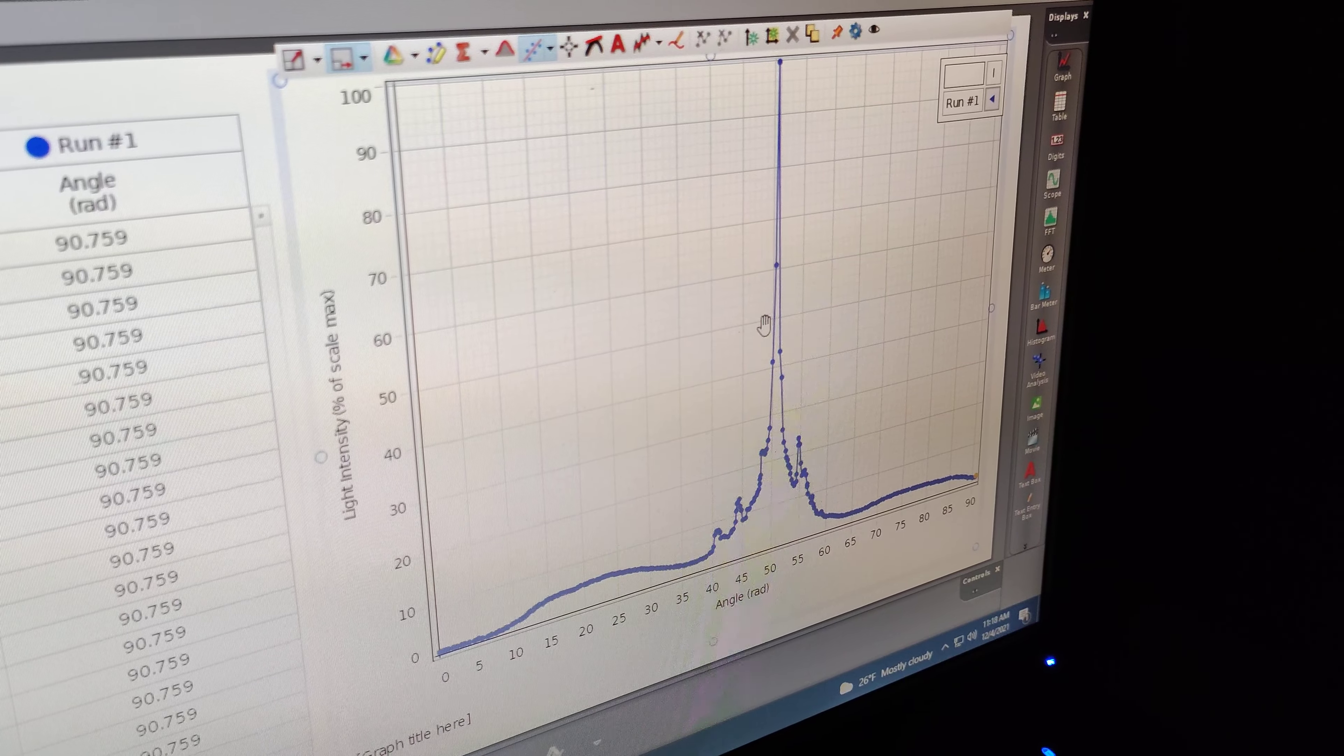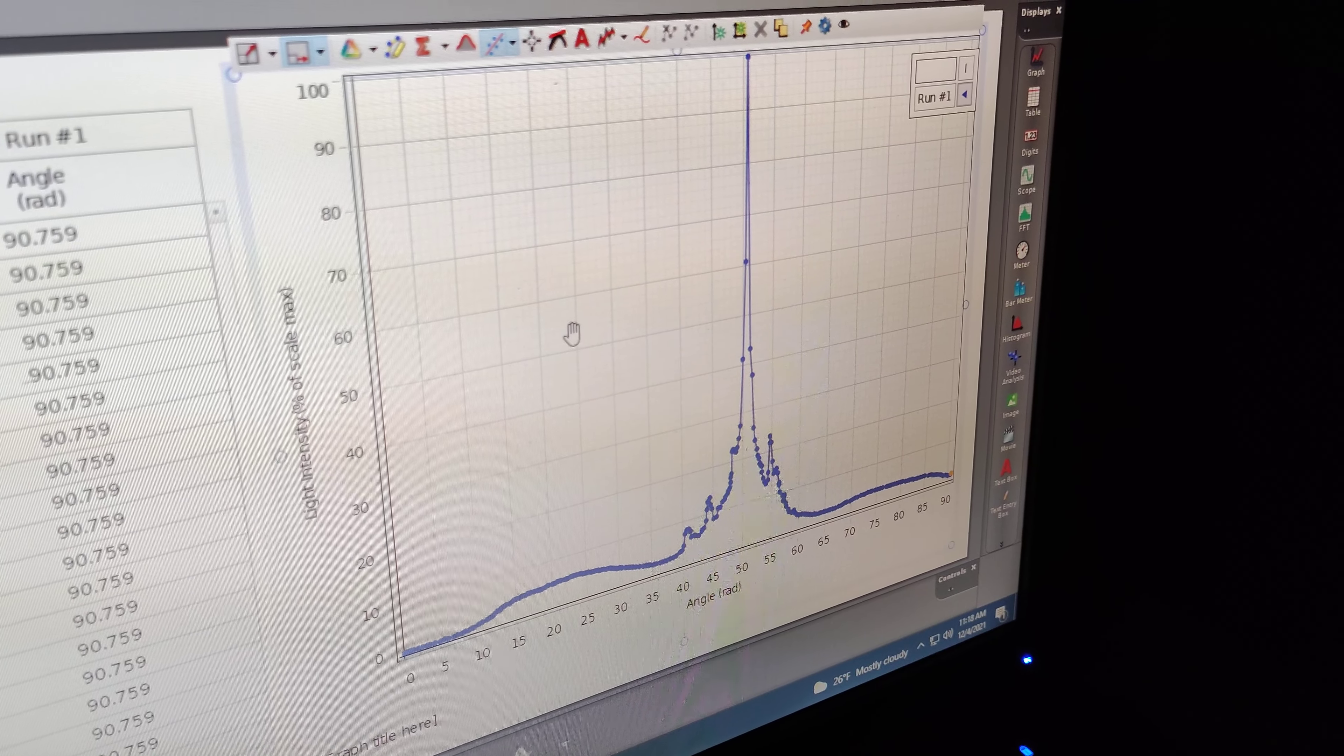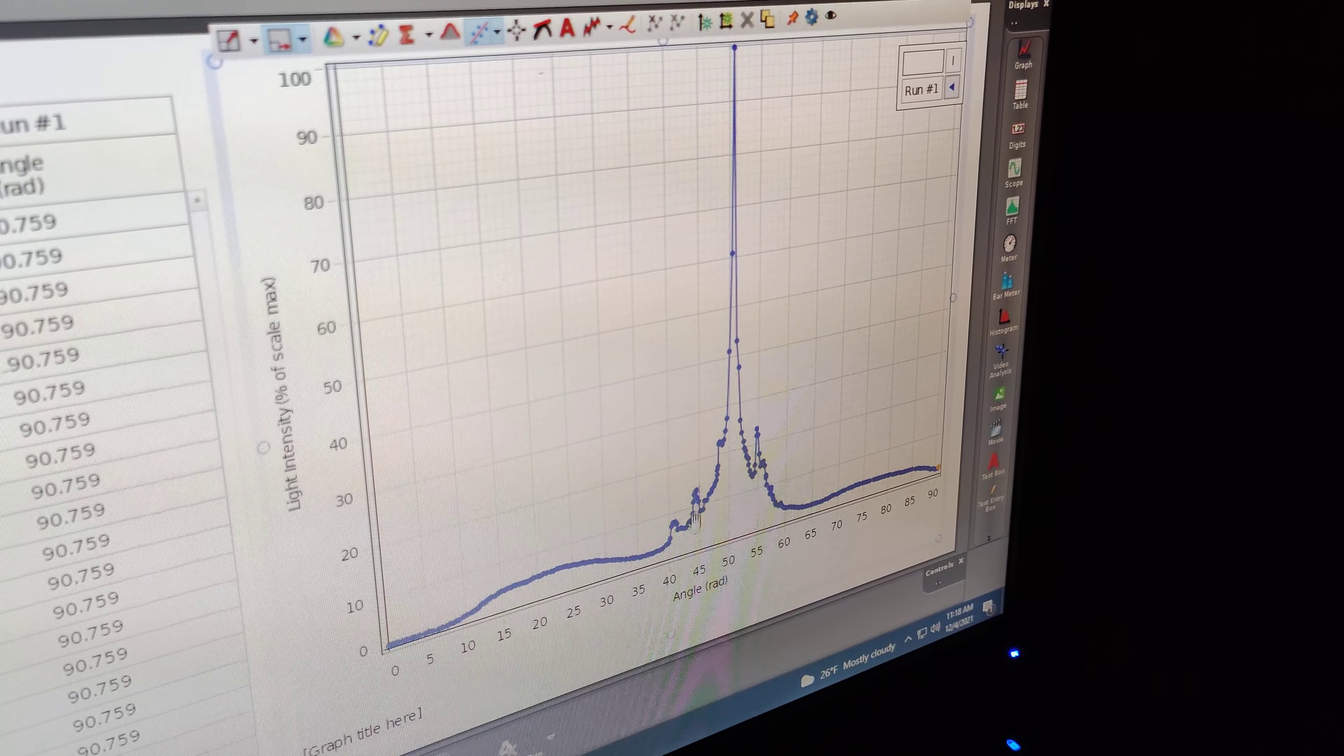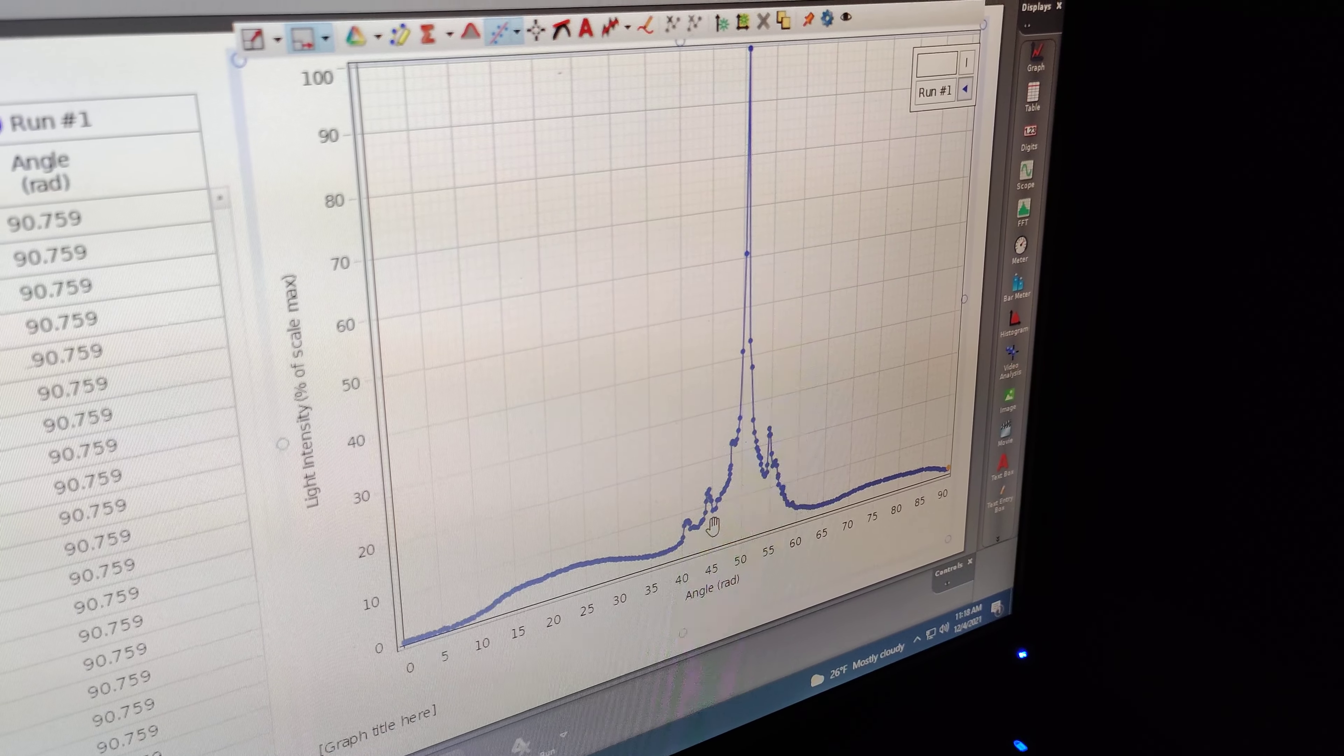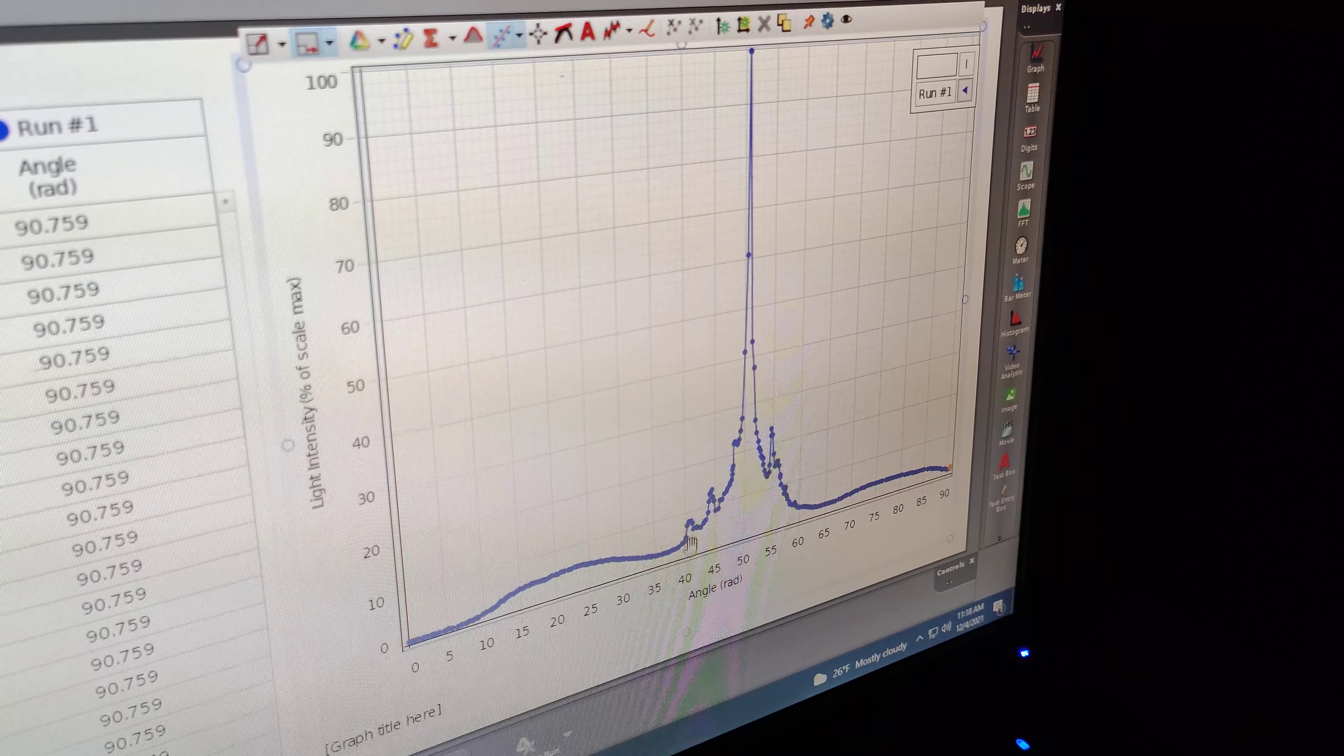try to take two data sets and put them into one graph to see what are the missing peaks or absorption spectrum of the water. Next, we're going to go to the second slit and then add to the third slit.